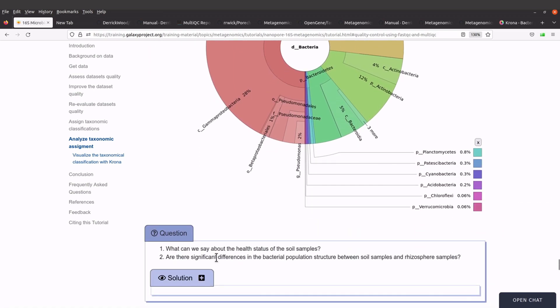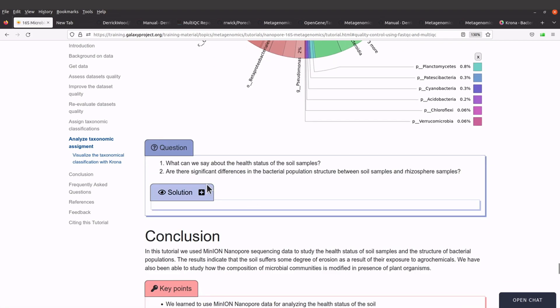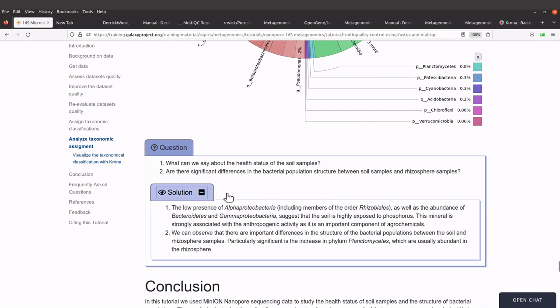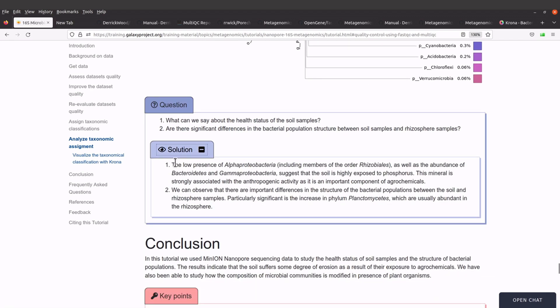Looking at the questions: the first asks what we can say about the health status of the soil samples. The answer states that the low presence of alpha proteobacteria, including members of this group, as well as the abundance of these other groups, suggests that the soil is highly exposed to phosphorus.